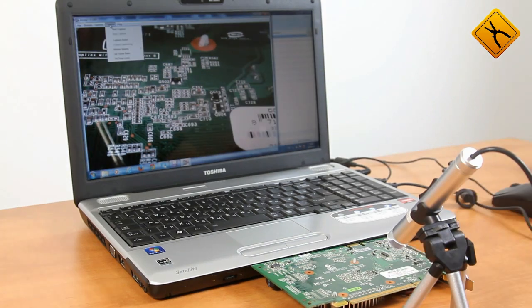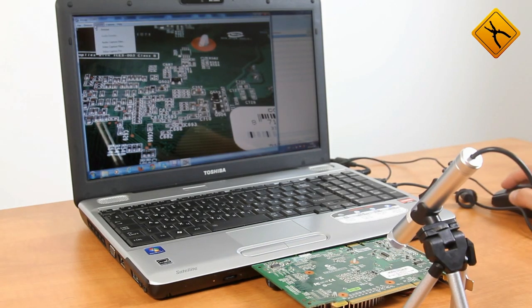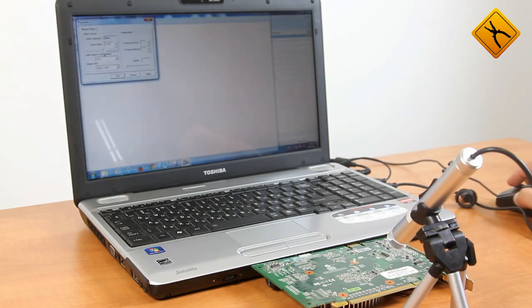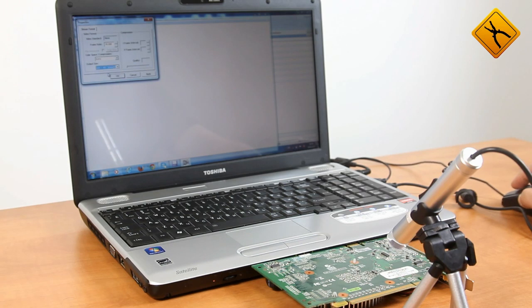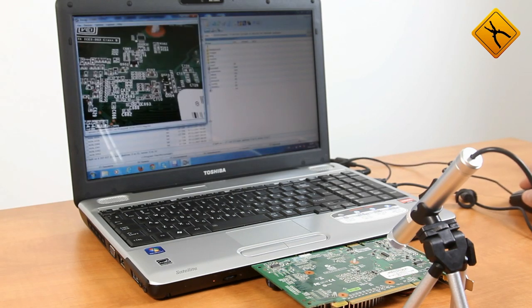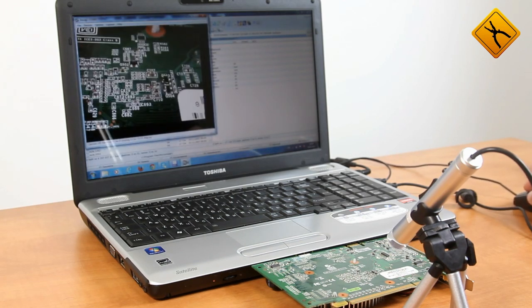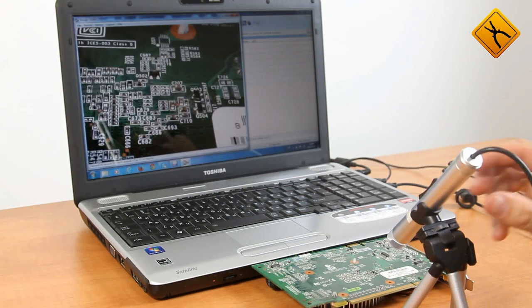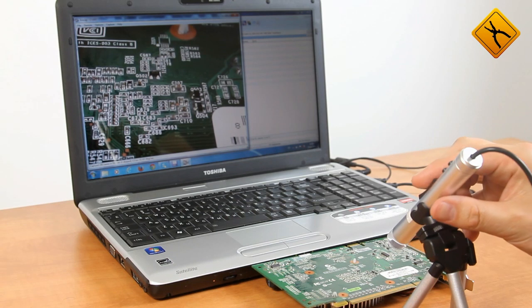You need to set a lower resolution, for example 640x480, to eliminate the delay. Let's change the resolution. Picture quality is obviously worse. Let's adjust the focus a bit.